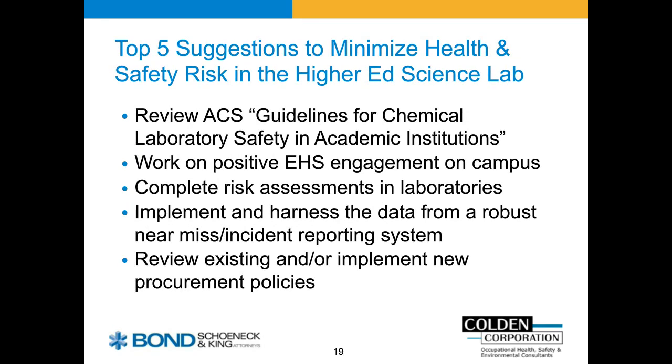So in summary, here are my top 5 suggestions, as Barry had wanted. Review that American Chemical Society page. There's great content in there. There's also great teaching content in there. You can direct instructors and PIs to get that into the curriculum. Working on positive EHS engagement on campus whenever and wherever possible. Insert yourselves. Boots on the ground.